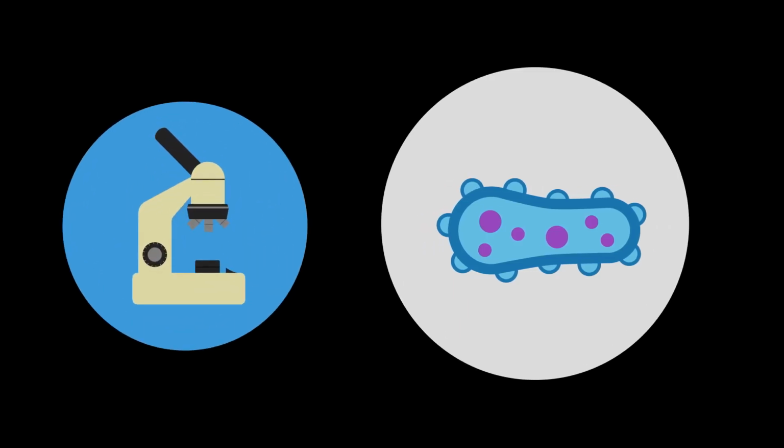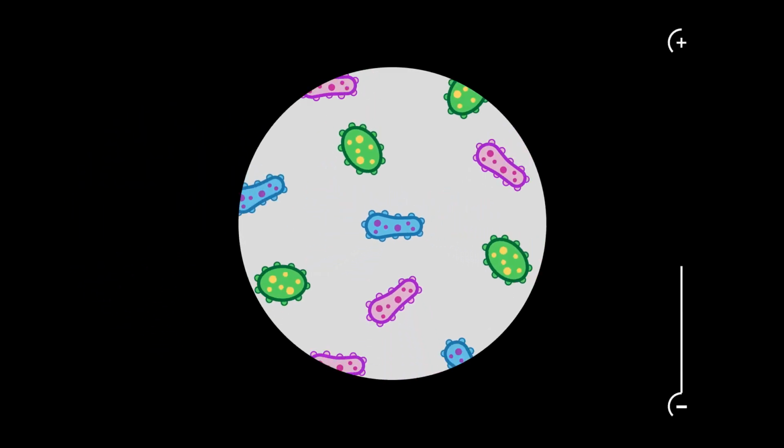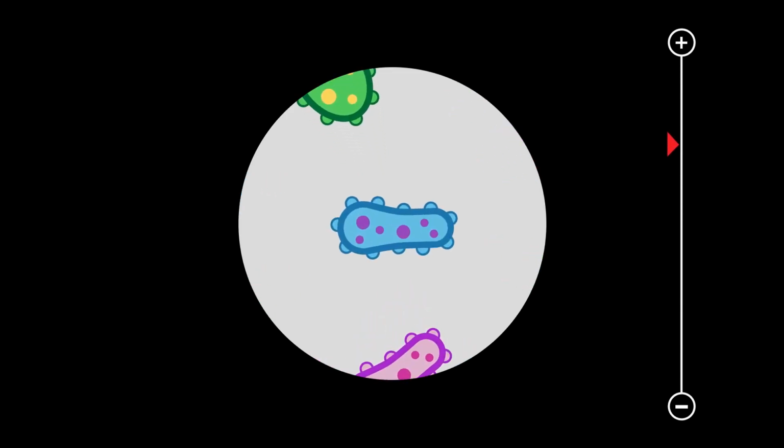Microorganisms are so called because they can only be seen using a microscope. They are far too small to be seen with the naked eye. In fact, the invention of the light microscope opened up a whole new world to scientists, the microscopic world. A microscope magnifies objects and makes a larger image. This allows us to see objects in more detail.